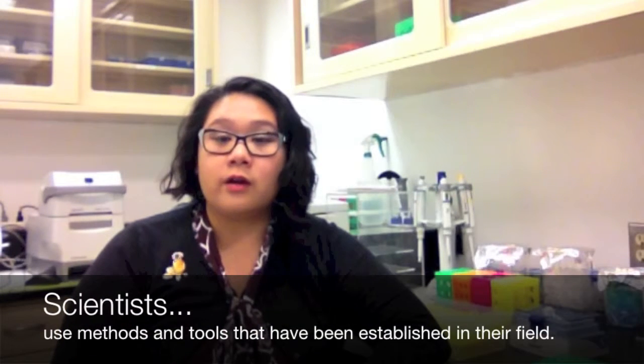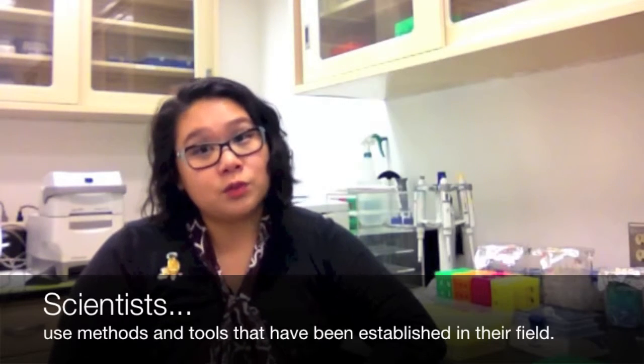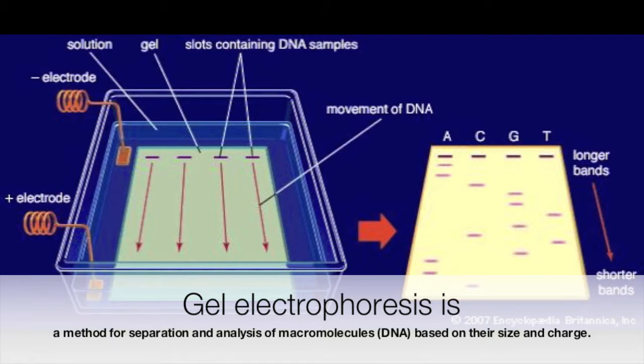Many times when we do DNA analysis and we utilize the PCR, the polymerase chain reaction, we are left with a couple of microliters of clear fluid, and we don't know whether or not our results have turned out. So in this case, we need to be able to visualize our DNA. To do so, we utilize gel electrophoresis as well as capillary sequencing.